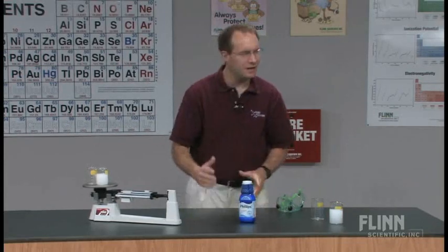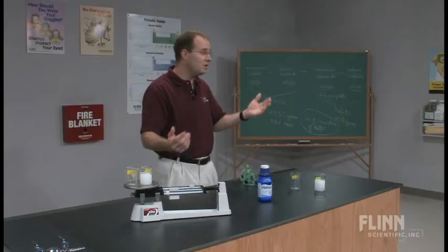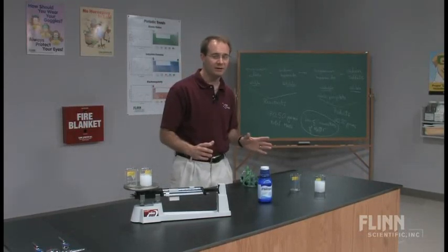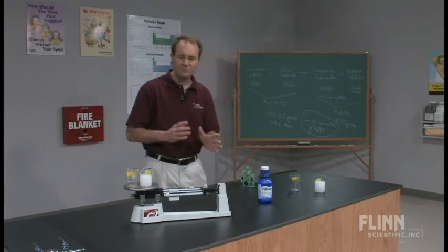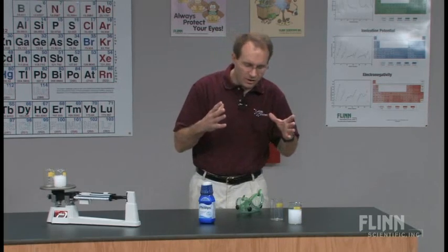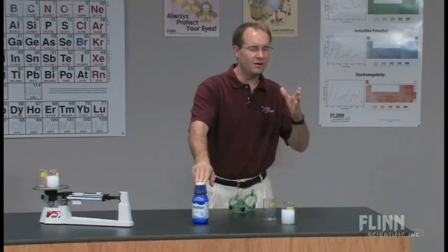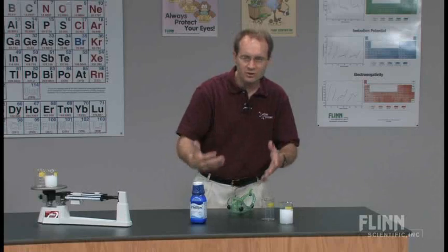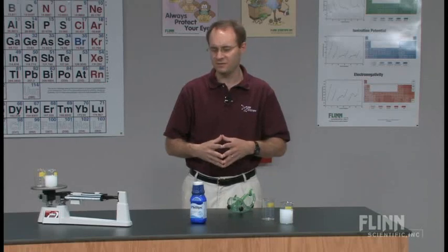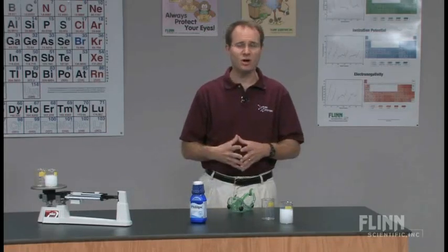So lots and lots of chemistry can be taught with this demonstration. Sometimes I feel, as a chemistry teacher, I know I'm in a hurry. You can mix chemical A with chemical B, get a precipitate, and teach very quickly. But this is one of those where you can incorporate many different concepts, some consumer chemistry along the way, and for those who are not going into science, this take-home message that multiple types of college majors will use chemistry, and the consumer chemistry is a very important life lesson for them. So I hope you enjoy the Milk of Magnesia demonstration and how I teach the law of conservation of matter.